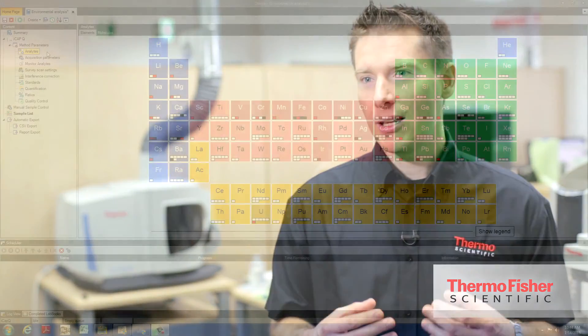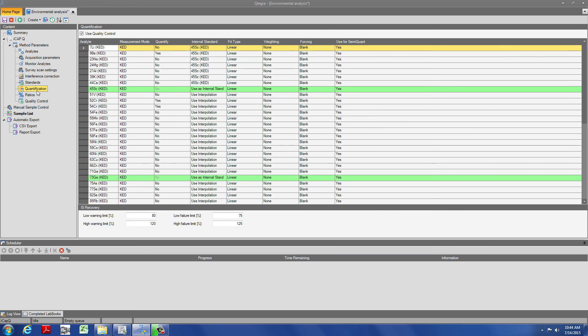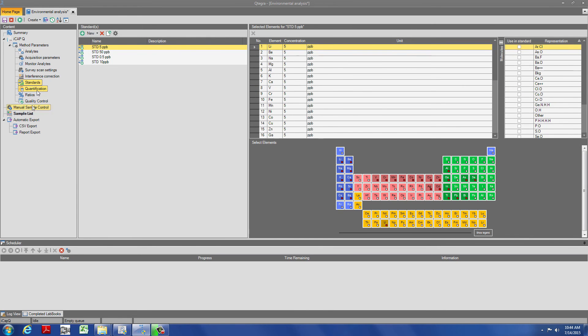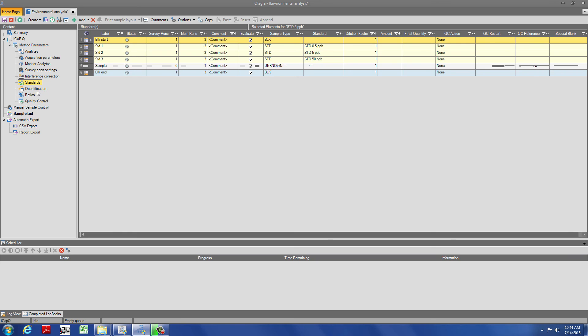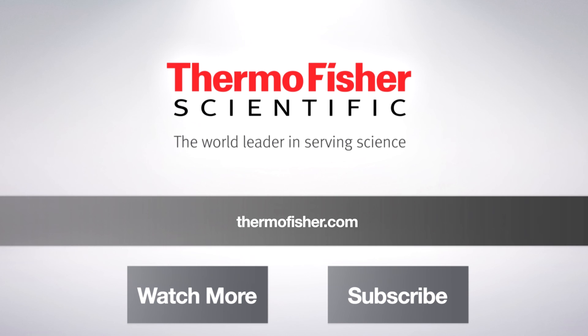The Thermo Scientific Qtegra software is the tool that helps accomplish just that. It features a specially designed workflow that brings you from a predefined set of method parameters to a sample list — including all the necessary QC steps to ensure result quality — within just five clicks, getting you very quickly from sample to results.